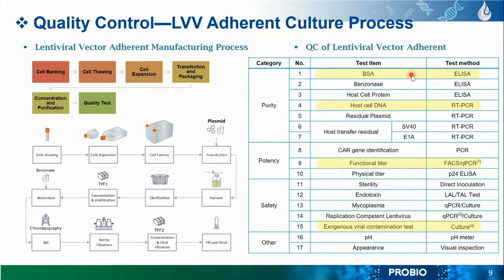This is the assurance that each batch meets specifications. You have to be specific with the purity, the potency, the safety, and identity. Therefore, the QC testing should be precise and accurate to help the clinical investigation team and the regulatory team understand how it works.